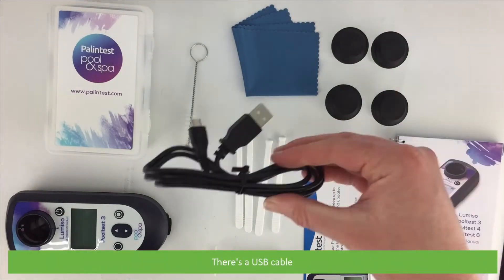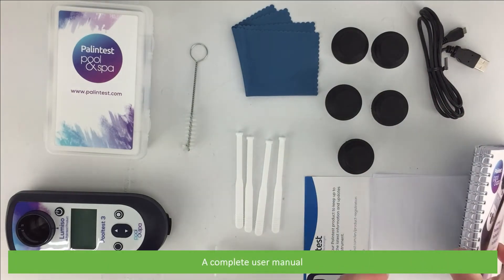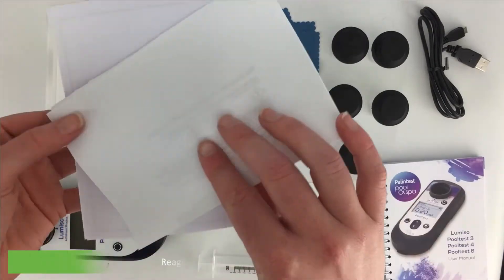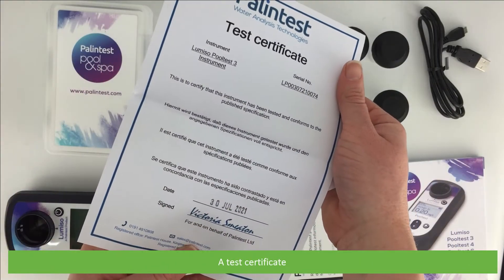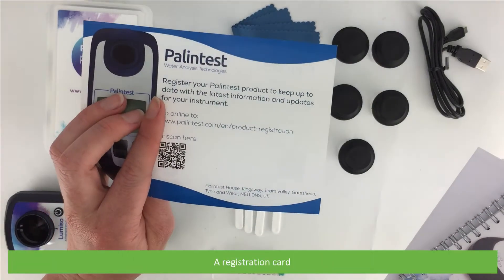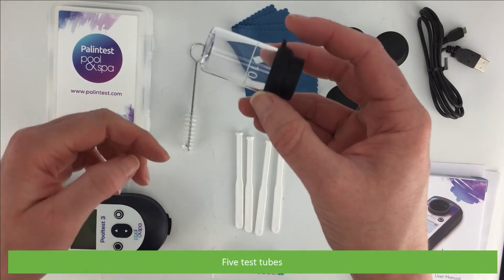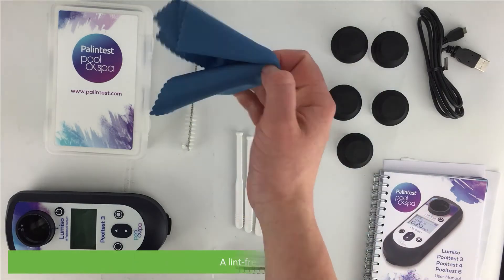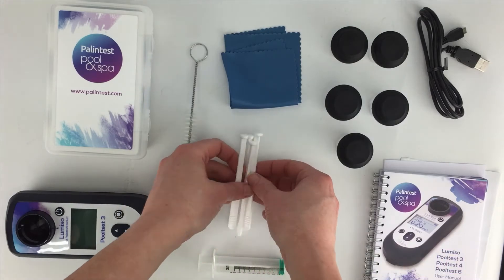There's a USB cable, a complete user manual, reagent chemical information and warnings, a test certificate, a registration card, five test tubes, and a lint-free cloth.